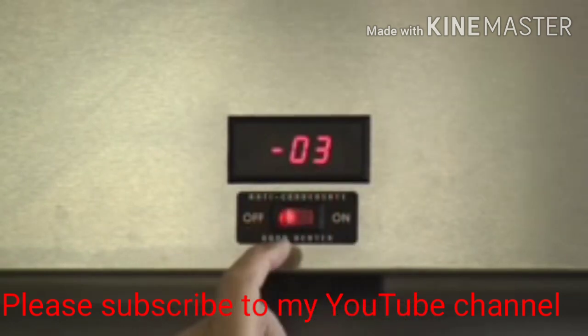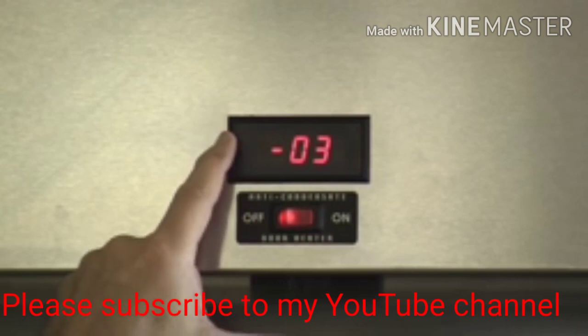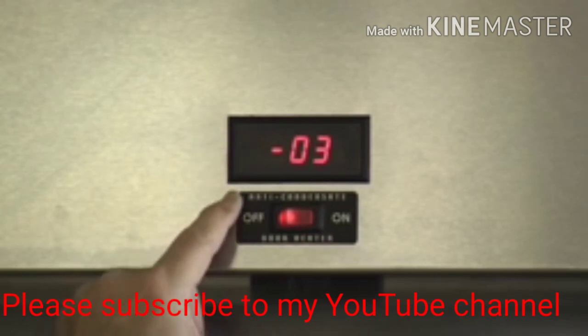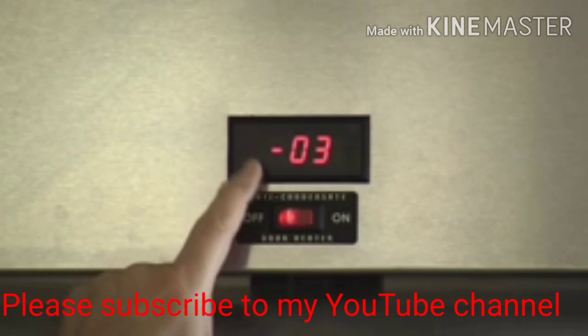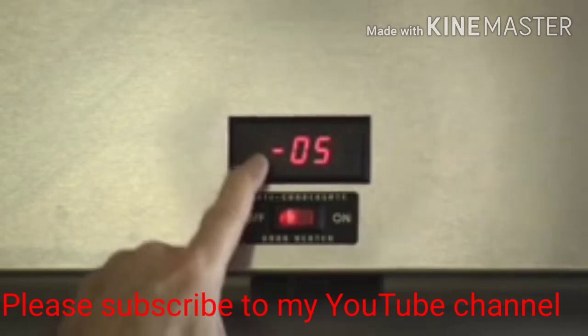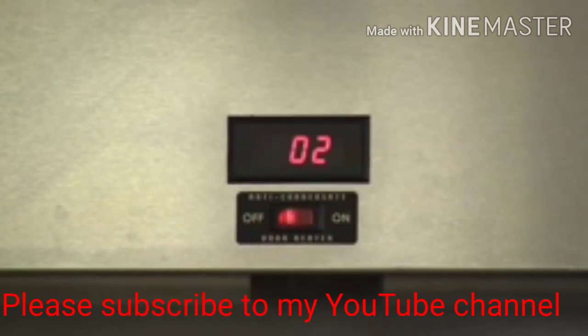Hit it a second time and you'll see a number. If you need to increase the temperature on the thermometer, go to the upper left-hand corner; to decrease, use the lower left-hand corner. Figure out how many degrees you need to change, push that the number of times, and go back over to the right until you see the desired number that corresponds to the inside.